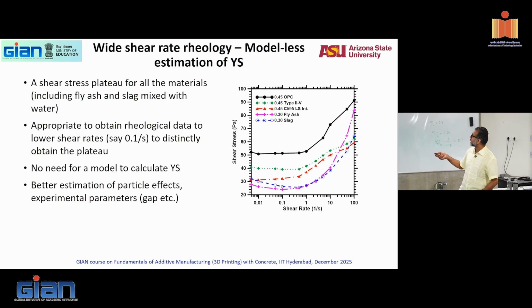So here is one way, the wide shear rate estimation. Now you see you don't have to draw a straight line here. You can go and get the apparent shear stress from a really low shear rate value. So this will be your shear stress. Don't worry about which model is the right model. The model really doesn't matter. All you need is to go down to low enough shear rates. Now, there are problems. Sometimes some machines will not be stable at very low shear rates, so you do accordingly whatever you have to. But again, make sure that if you're comparing, compare apples with apples, never apples with oranges.